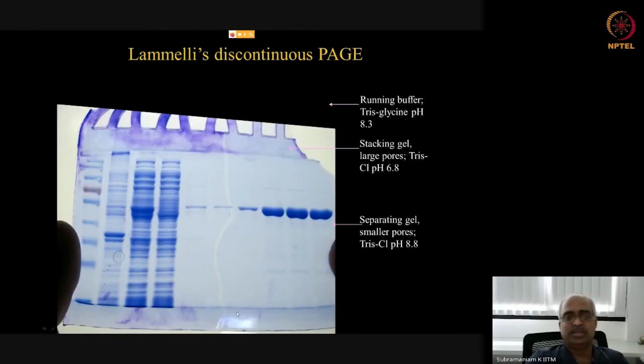Here I'm going to explain that in detail. And before I go into SDS, I want to explain one more detail about this basic polyacrylamide gel. PAGE stands for polyacrylamide gel electrophoresis. In the most common method that we do, where the separation is purely based on charge by mass ratio, and when charge is constant, it is only the mass that matters, what we actually do is boil the protein in a buffer that contains this ionic detergent, sodium dodecyl sulfate, SDS. This is a strong ionic detergent.